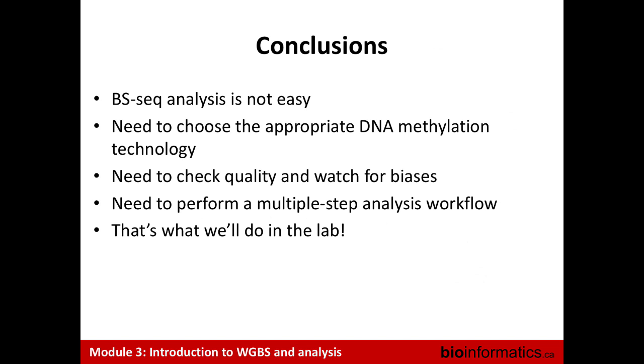Okay, so any other questions? Hopefully it wasn't so bad the way I described it. WGBS analysis is not easy. I think some of the concepts are a little bit tricky when you think about these converted reads, and you'll see that in the lab, but again, there are tools that have been written to do that.